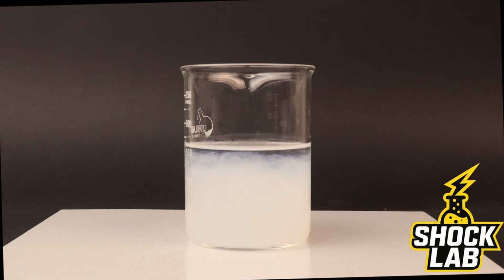The clear solution has transformed into a thick white suspension, and nothing seems like it's going to change. But that's not the end of the experiment.